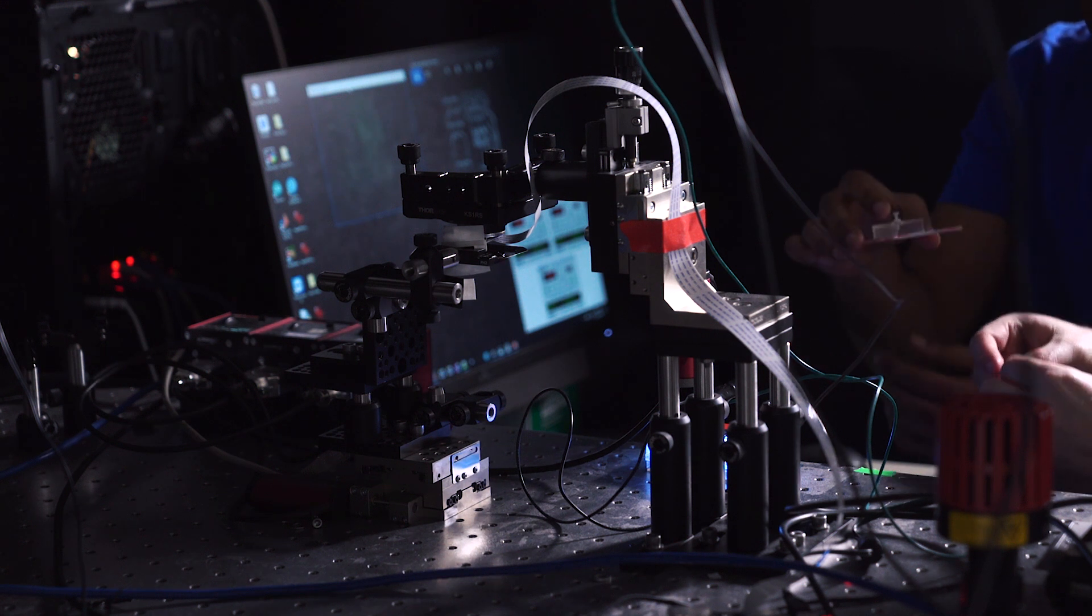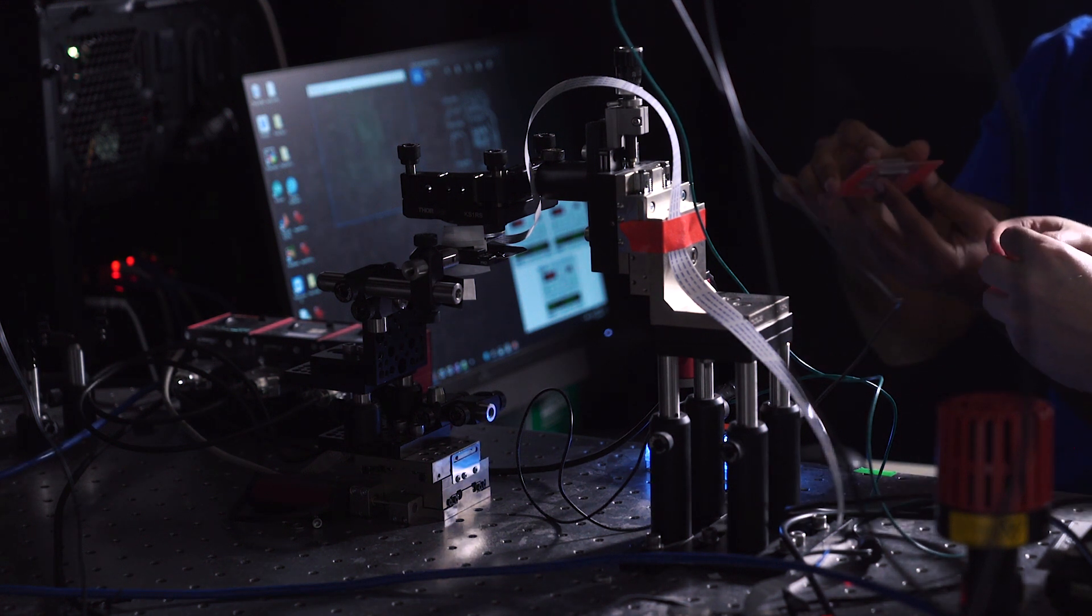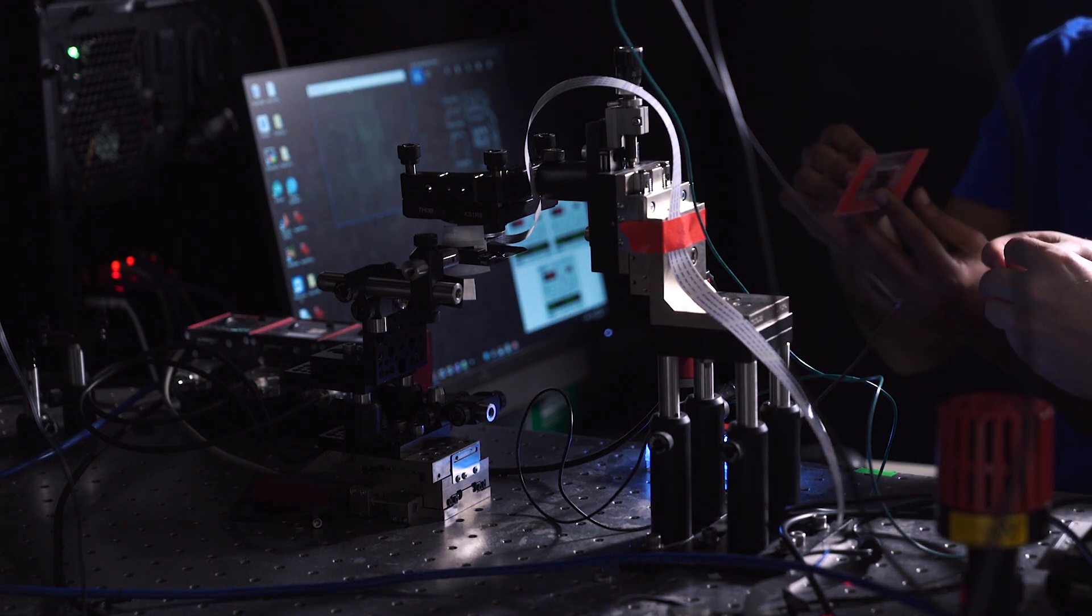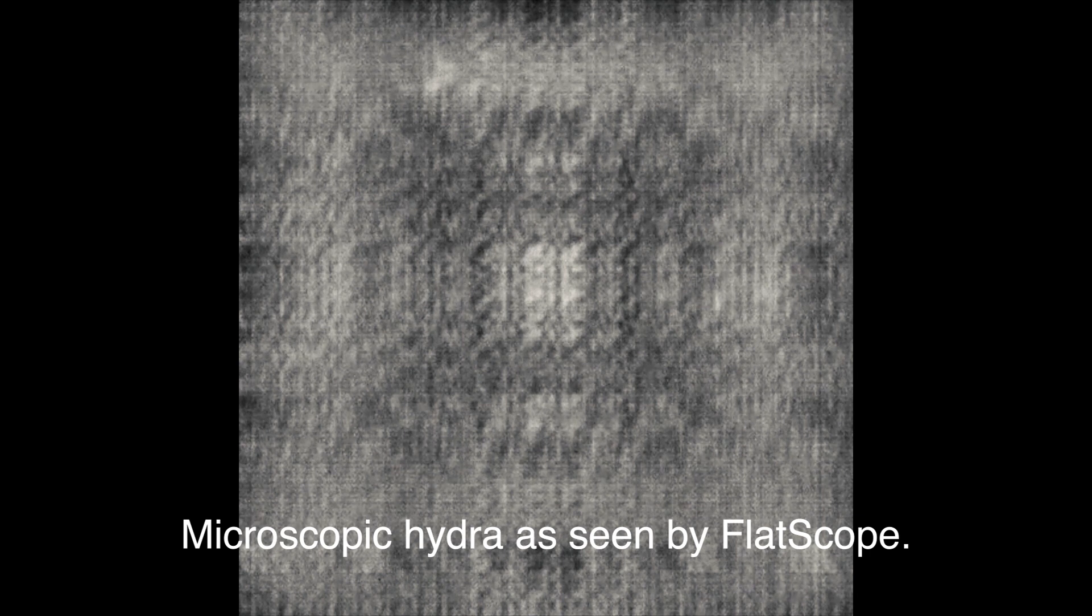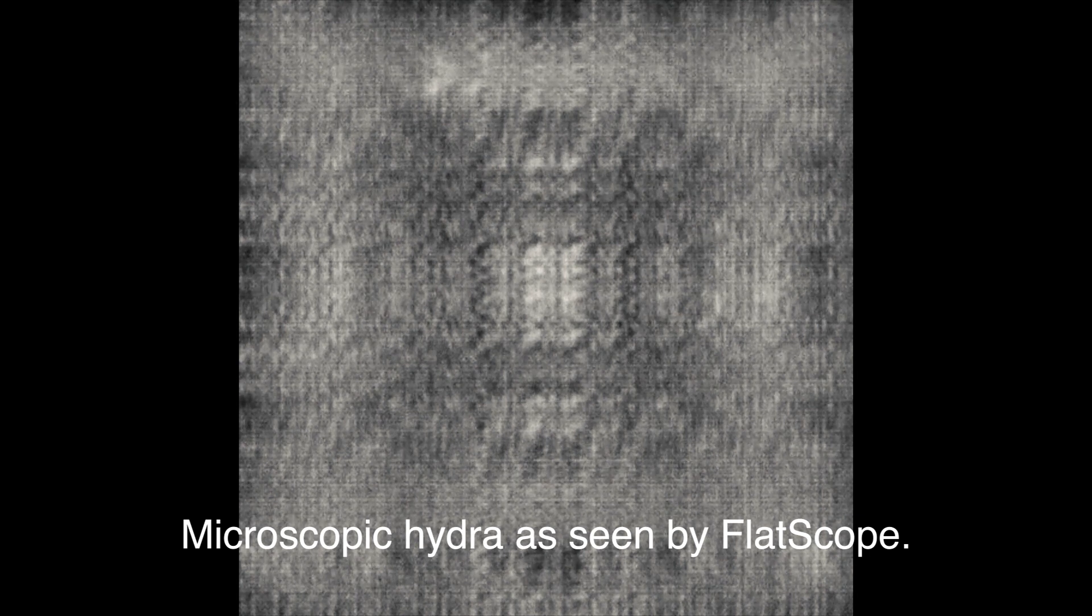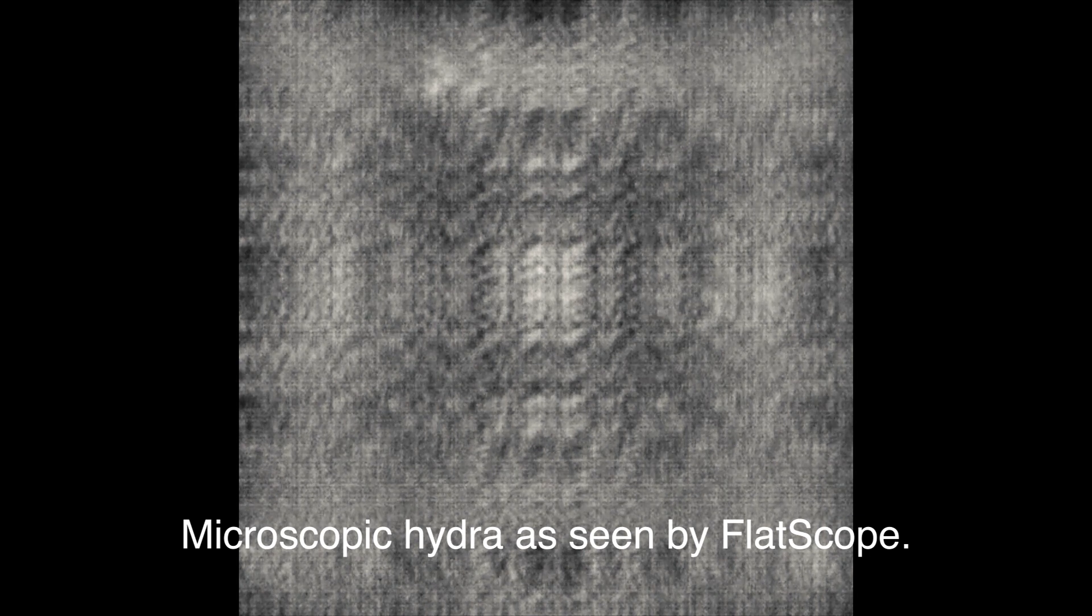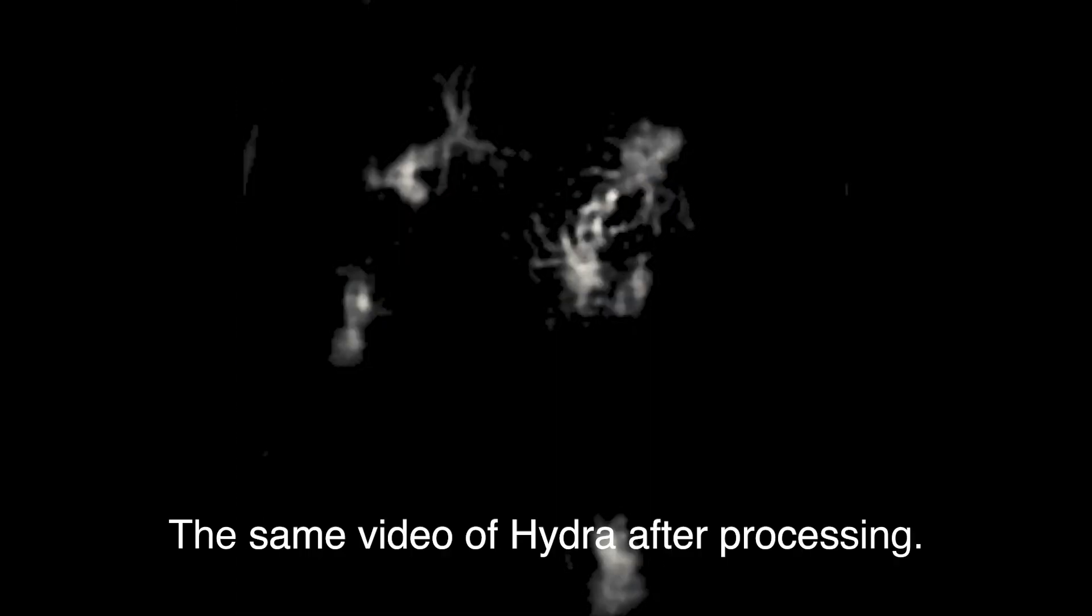What we've done with this flat scope is shown that when you don't have lenses, you don't have to make that trade-off. So we can see things that are very tiny, but we can see them over a large area.